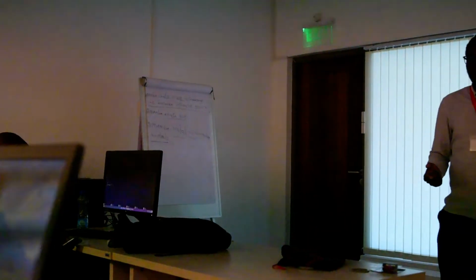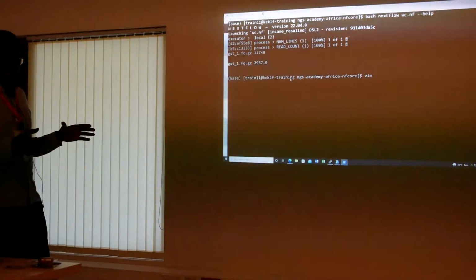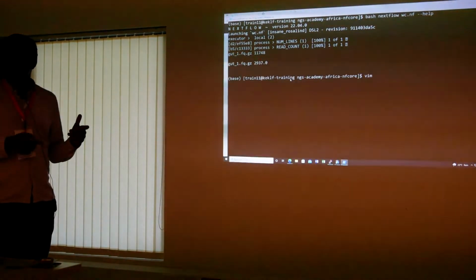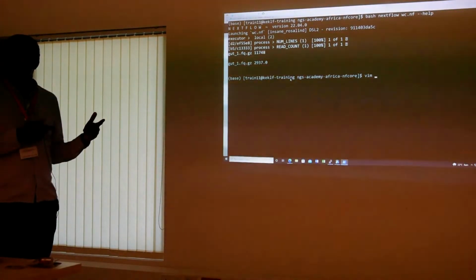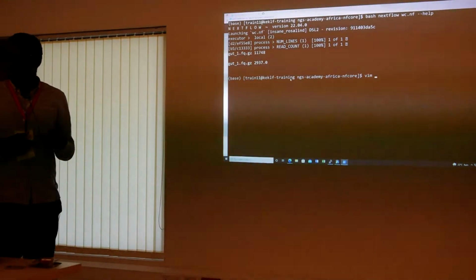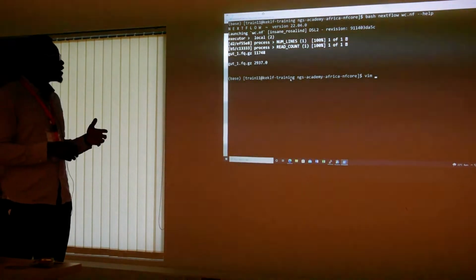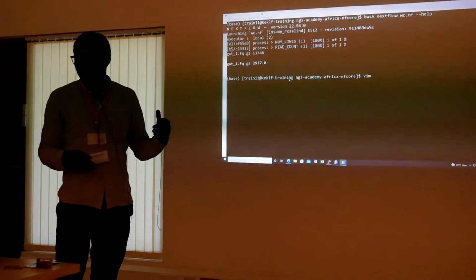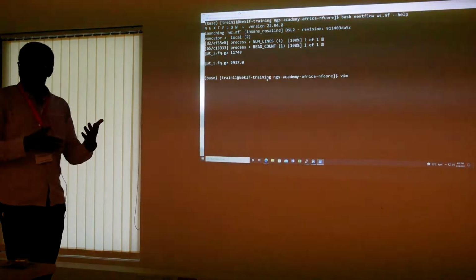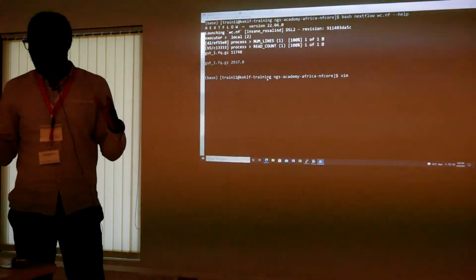As I mentioned, Nextflow allows you to track changes. So in case I've made anything to my script or to my task, I'm able to get it in a different directory as opposed to the initial directory which it had output the results. You can still resume in case it was broken. You can use a flag -resume, which is reentrancy, to pick up from where it stopped. But it allows you to track any changes that you've made to your script.